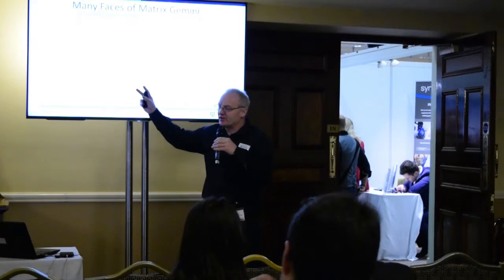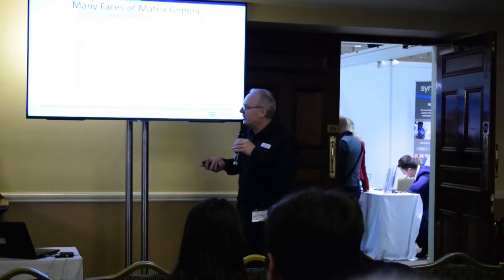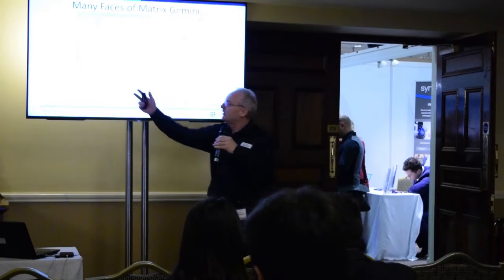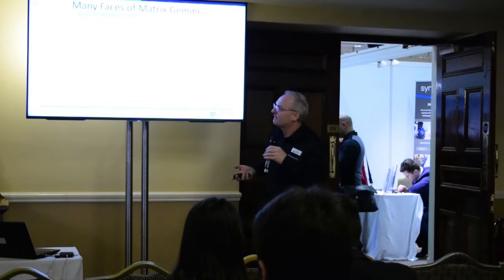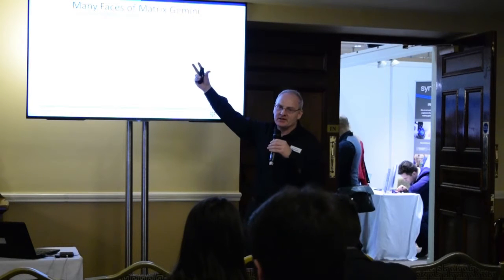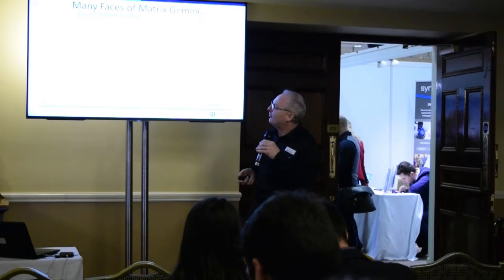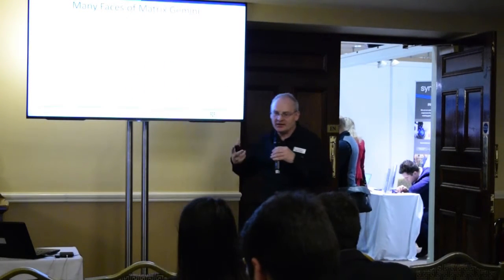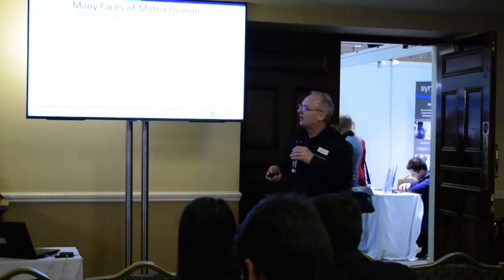This flow is actually a veterinary system, and this is being used obviously in contract veterinary labs, and you may be registering what sort of animal it is, which is equine, a cat, dog, whatever, what breed it is, what the name is, who the owner is, who the vet is. This is maybe a contract lab, and maybe it's being used remotely from the actual veterinary practice. So this is not a typical screen, and underlying is exactly the same software as I've shown. All this has exactly the same software behind it.